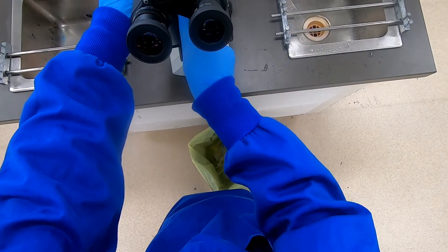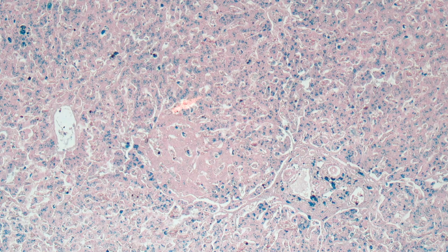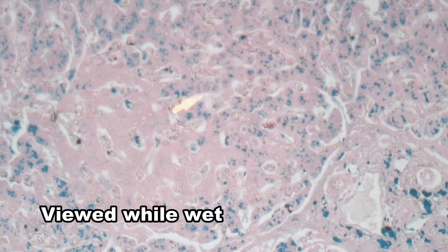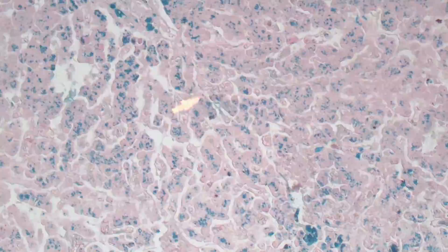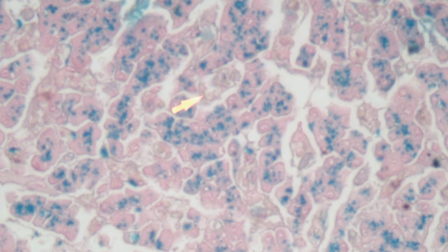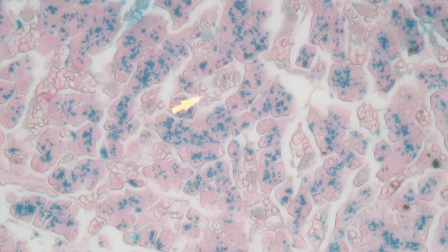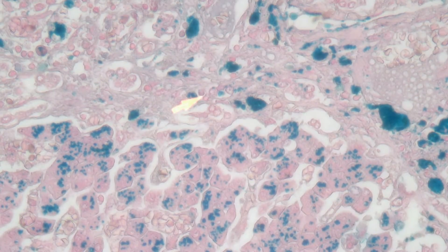Looking at the slide while it's wet—it's not ideal optics—but you can see there's now just a light pink blush through the back of the tissue. If we increase the magnification here, we should be able to see those lovely blue granules of hemosiderin within the liver.